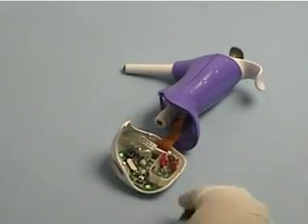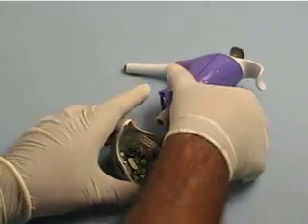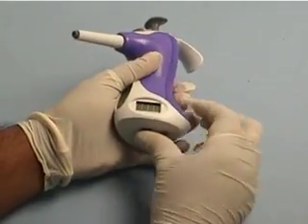Install the new battery matching the polarity to the symbol imprinted between the battery clips. Carefully fit the base back onto the body of the pipette and tighten the screw.